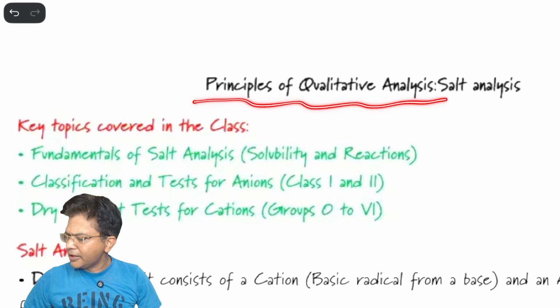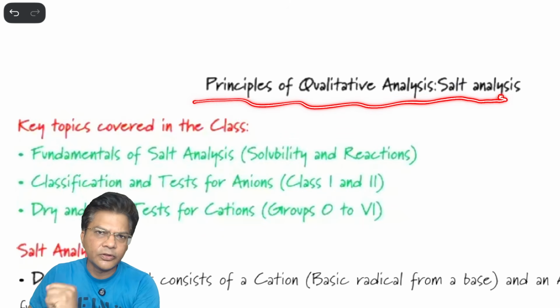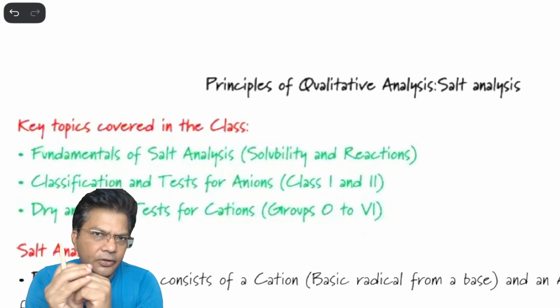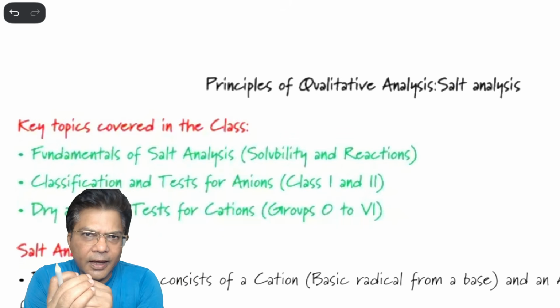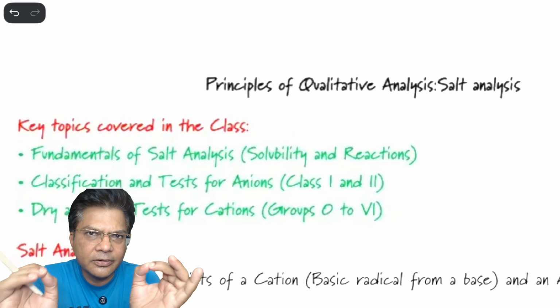Principle of qualitative analysis, salt analysis. The fundamental concept for salt analysis: first, we will talk about these 2-3 points just for 1 to 2 minutes, and then I will let you know each and everything in your NTA syllabus.